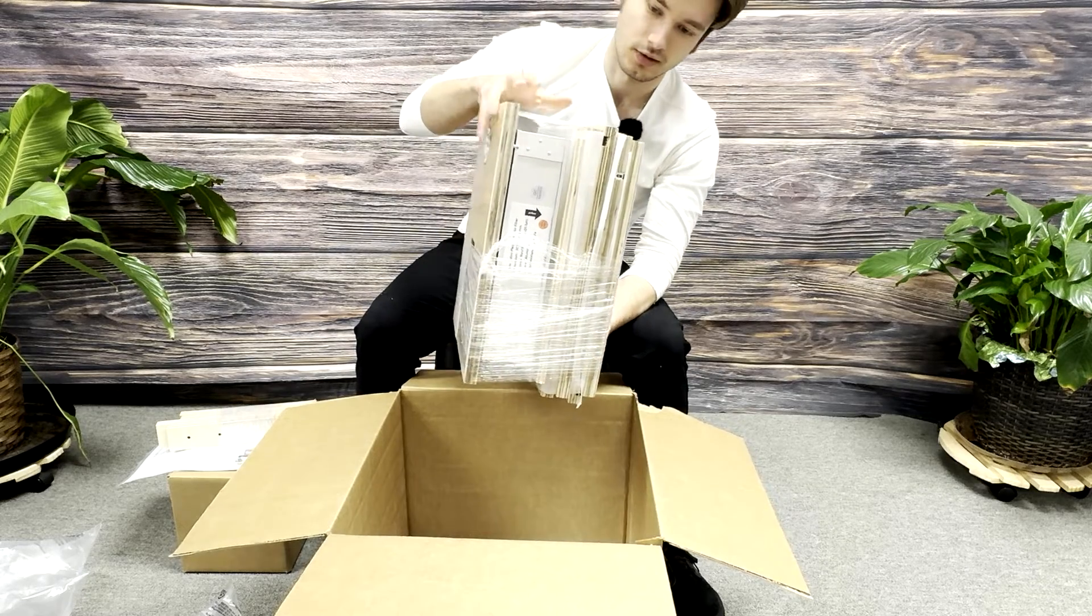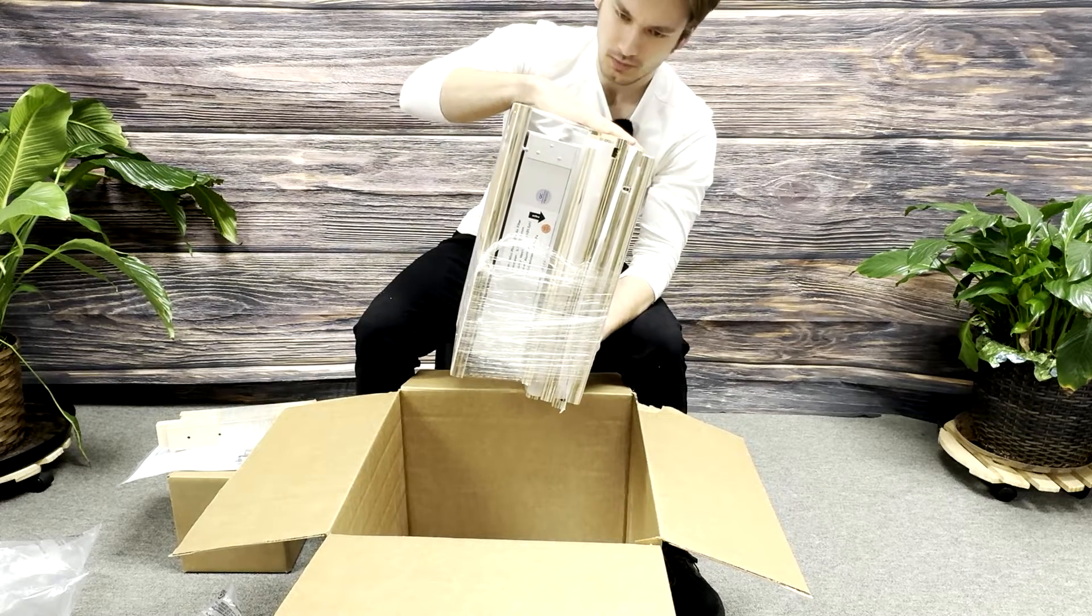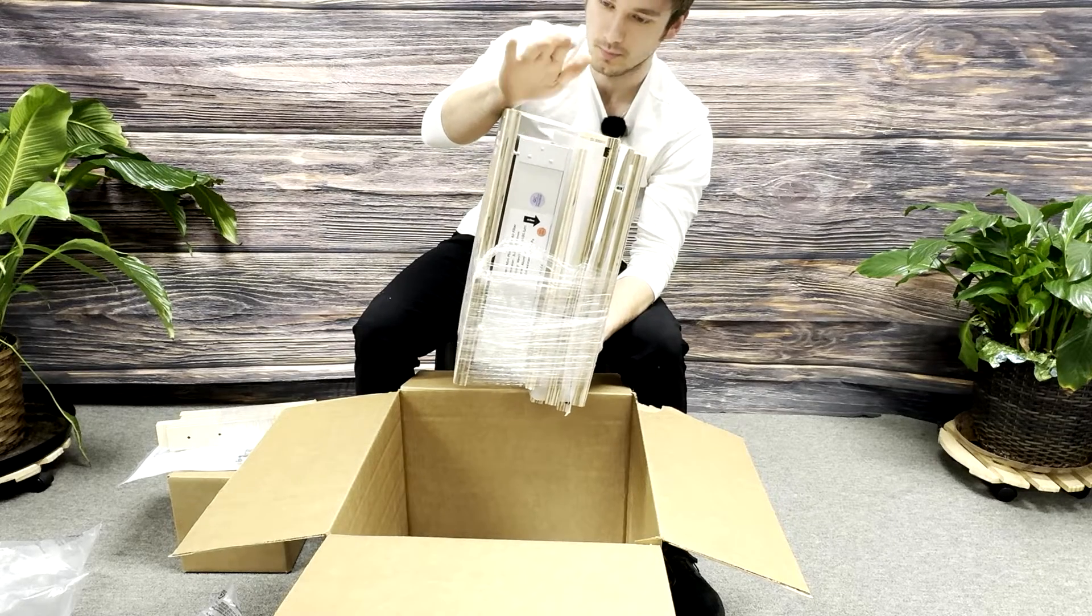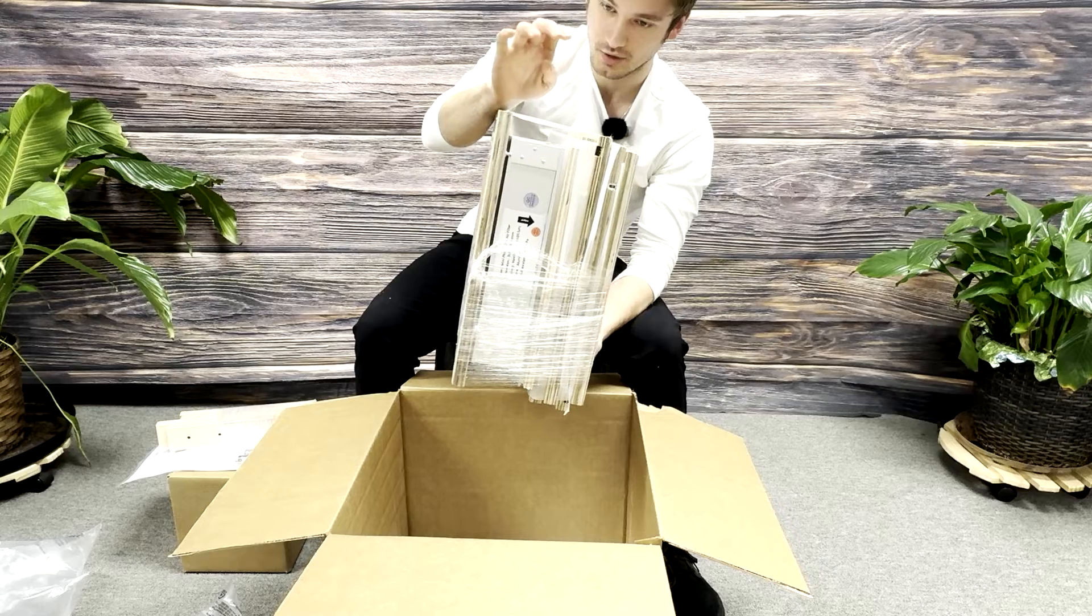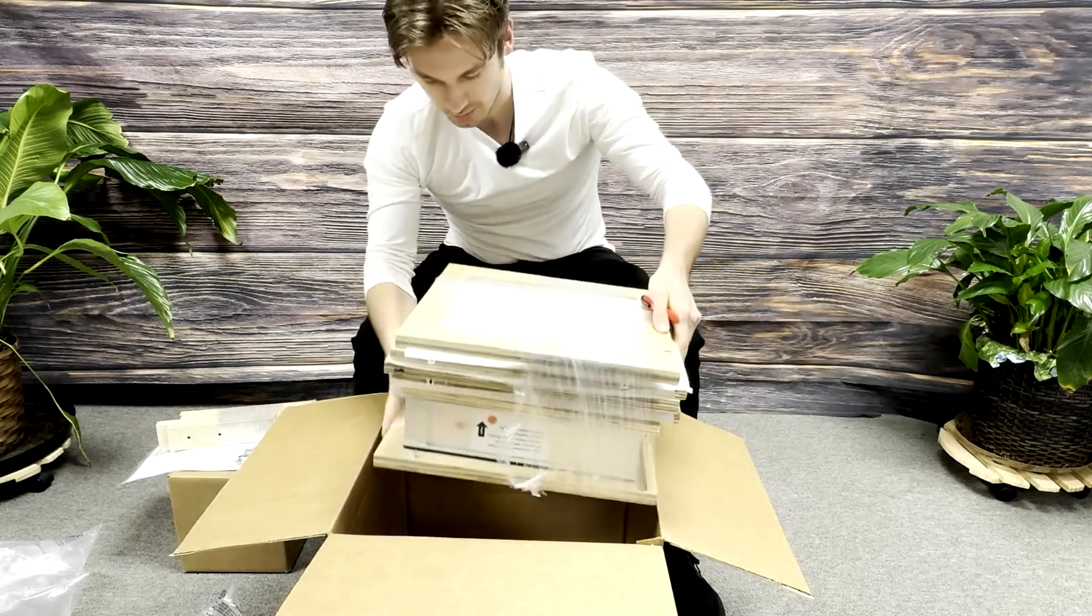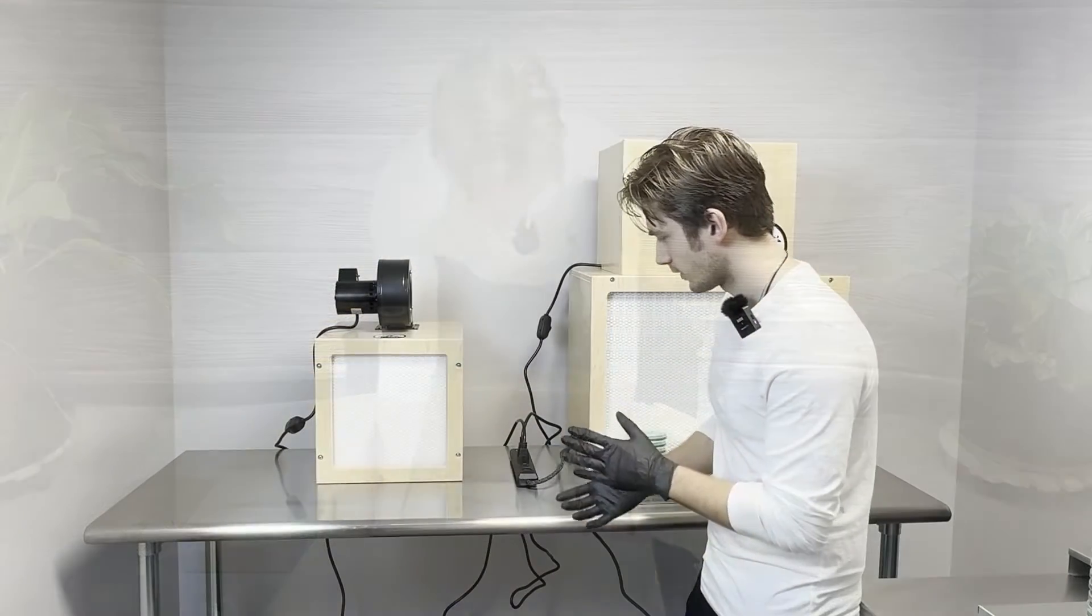This is your bumpers, face plate, as well as the filter that is actually producing the laminar flow. And this is everything that you need for your Bonsai.